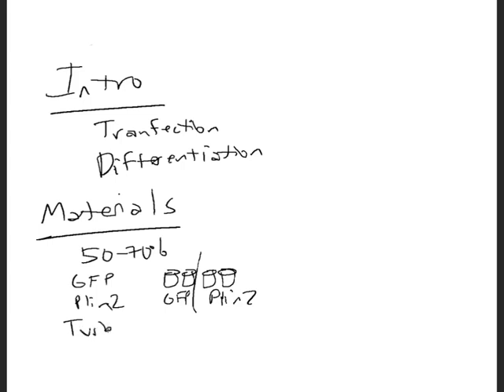We would have basically cultured the plasmids with turbofectin. That's the reagent that we use. You just use about a microliter of this with a couple microliters of the plasmid. You mix them together, let them sit for a little bit to form those micelles, and then you put them in there. Running time is up to 24 hours, but minimum 4 hours. So that's the basic materials and methods procedure that you would have on this write-up.